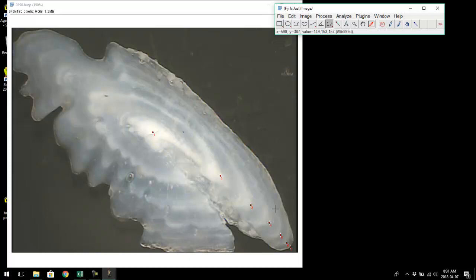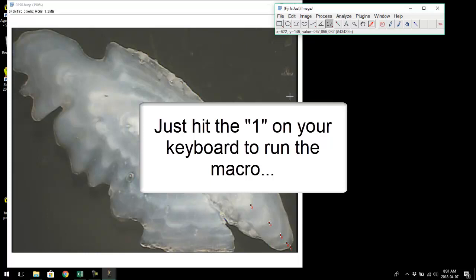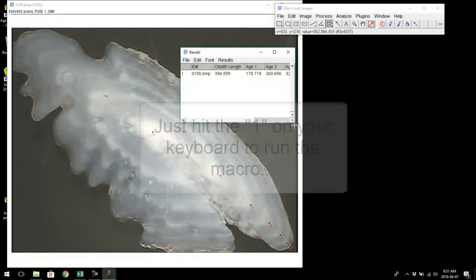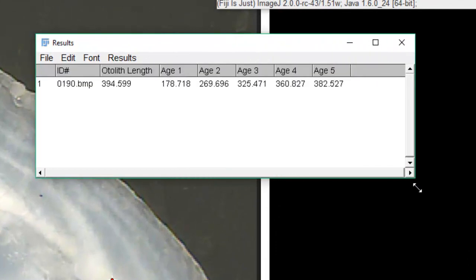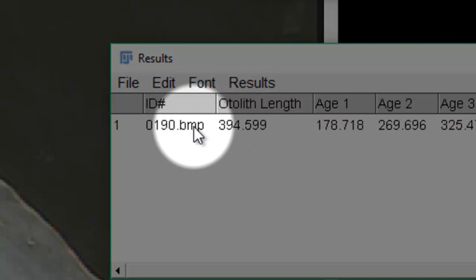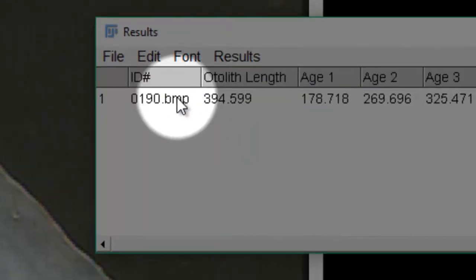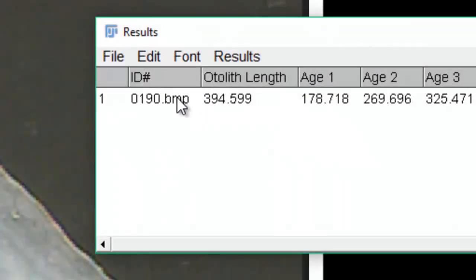Now we have everything marked and we need the distances — the distance to each annulus and to the otolith edge. That's where the macro comes in. I'm going to run the macro by hitting the number one on my keyboard. The results window pops up. The first thing it's done is put in the file name of the image, so you can track which measurements go with which image. If you name your images by fish ID number, you can keep track of everything.